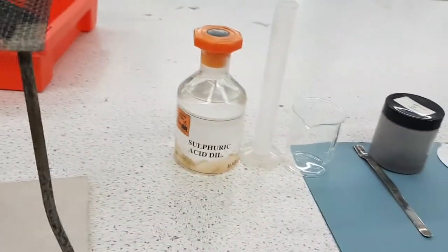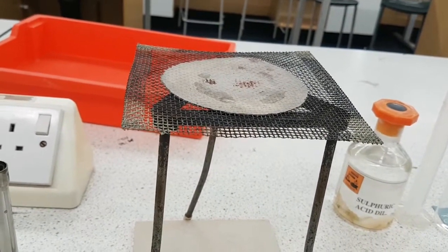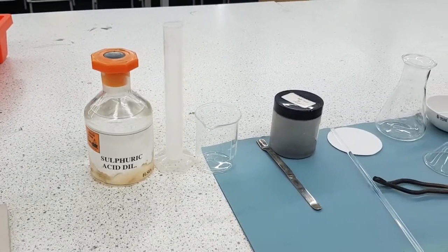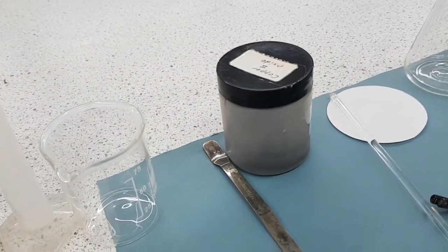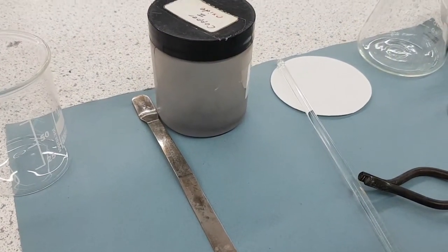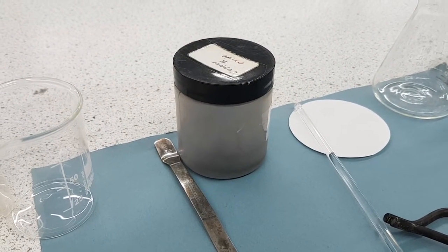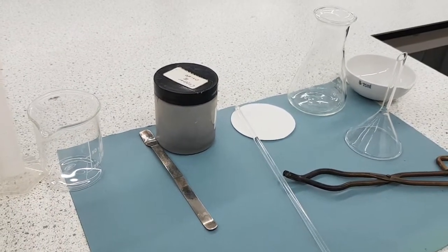Then you're going to put the beaker on top of your gauze and warm it up — you do not want to boil it, you just want to warm it up. Once it's warm, turn the heat off, then add your copper 2 oxide using the spatula to make a reaction happen. Keep mixing until no more will react and you're still left with some copper oxide that just won't react — so it'll be a saturated reaction.